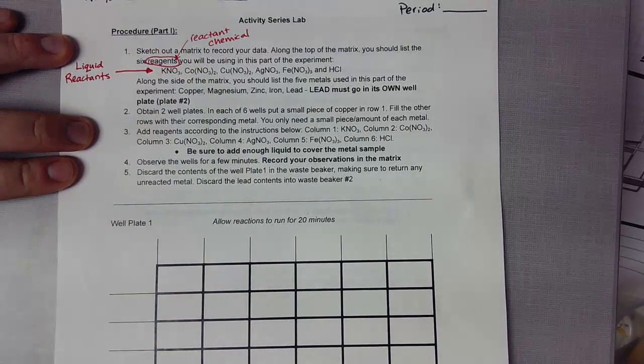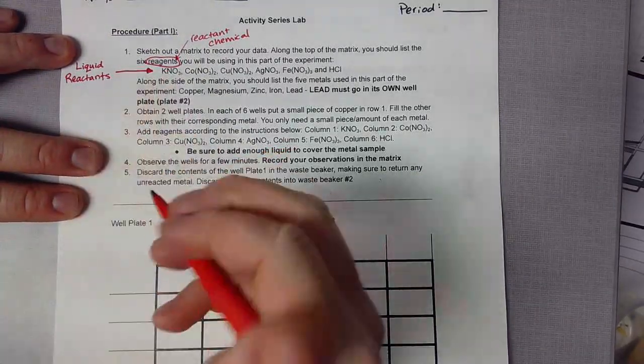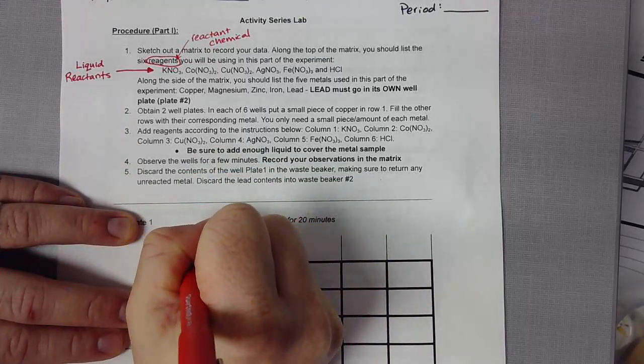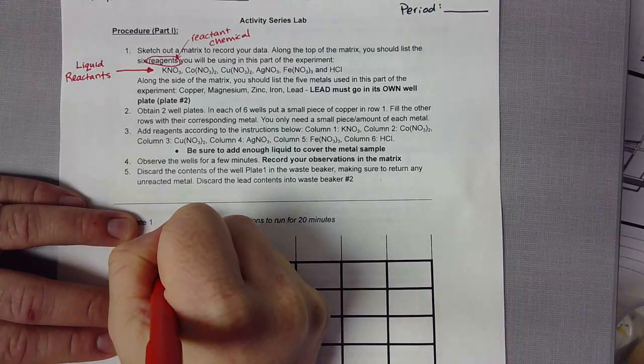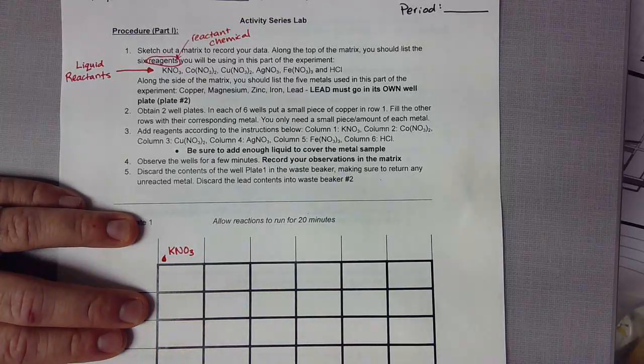They are going to fill vertically. So our first liquid reactant is KNO3, which means all of these wells are going to be filled with KNO3.